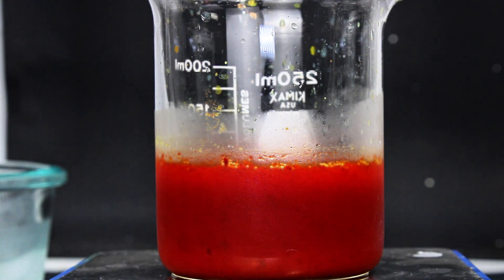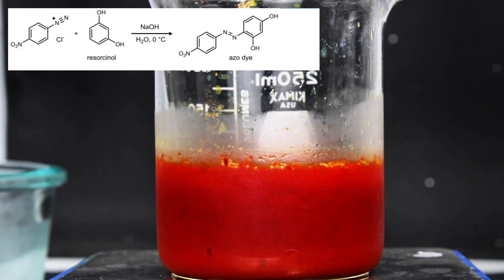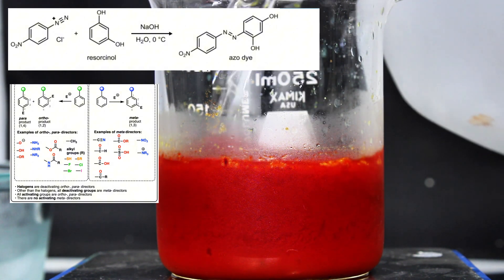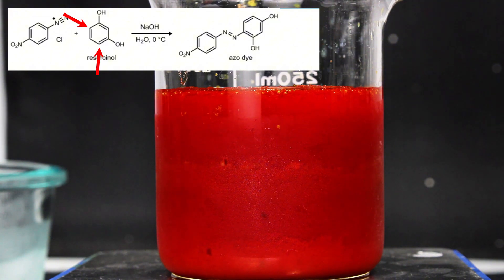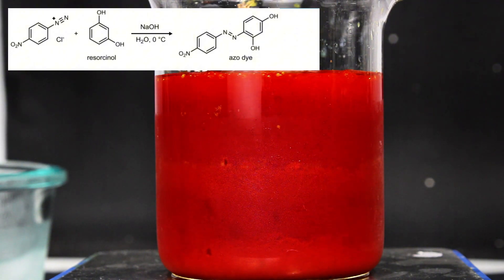Now while this is doing its thing, I'll try to quickly explain that second reaction, which is a textbook example of an azo coupling. This is a basic EAS reaction wherein the diazonium salt is the electron-deficient electrophile and resorcinol is an electron-rich nucleophile. The hydroxyl groups of resorcinol are strong ortho and para directors, but since ortho substitution at this position would be far too sterically hindered to stabilize, the diazonium salt exclusively binds to the para position. And that's pretty much the whole reaction — these specific types of reactions are honestly really simple.